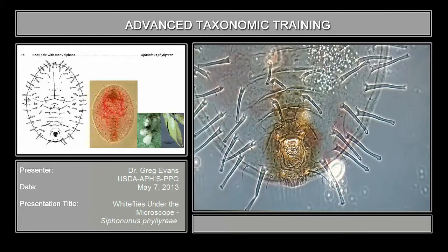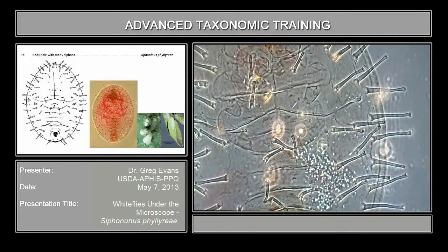Here's the transverse suture again. These are the A1cd — this is the first abdominal segment, so we call these the A1cd.